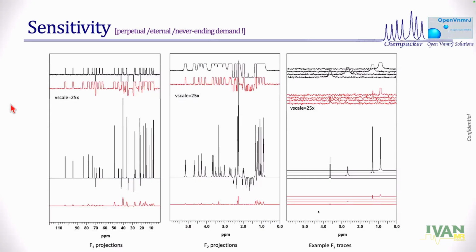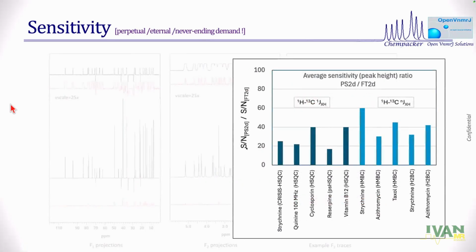That's the different F1 projection, F2 projection, this is the F1 projection, different traces. And we just blew both of them up on the vertical scale. This tells you how much our conventional signal to noise increased with respect to a constant floor noise. That can be analyzed, and then we say we generate 60 times signal to noise as per the definition.